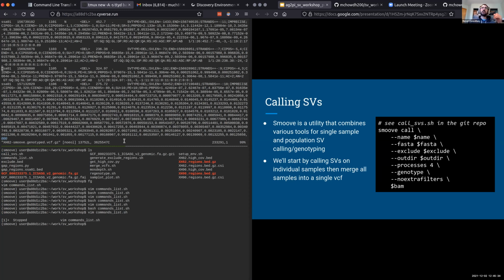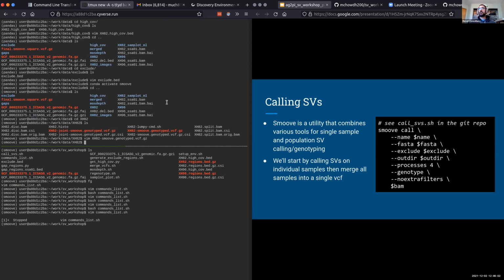And in general, the VCF format isn't really meant to be human readable, but rather something that you would query using a tool like BCFtools to then output into a format that's a little bit more human readable, which we'll be doing a little bit later on. But you can still examine various things here if you know what to look for. But in this particular case, we will not examine this that much further since it's not really meant to be read as such.